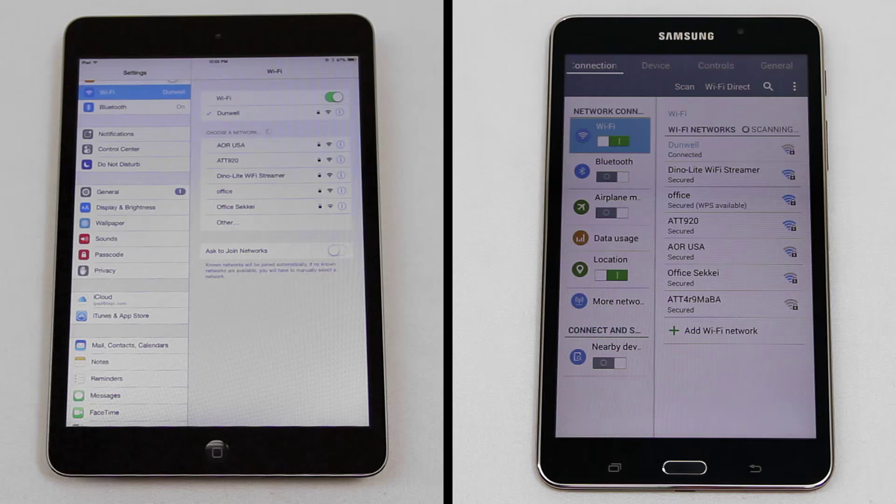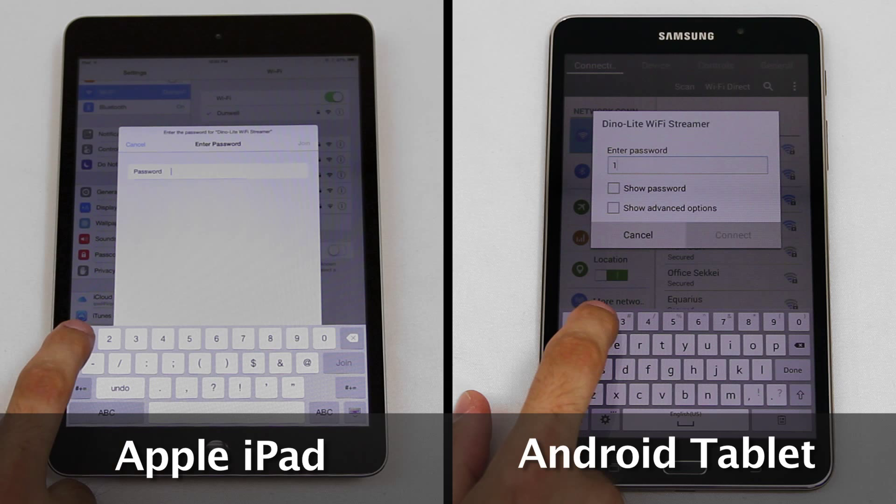Enter the Wi-Fi access password, which is by default 12345678. This setting can be changed from the app later.